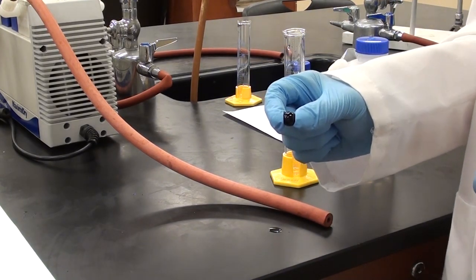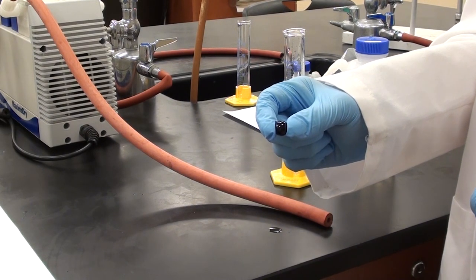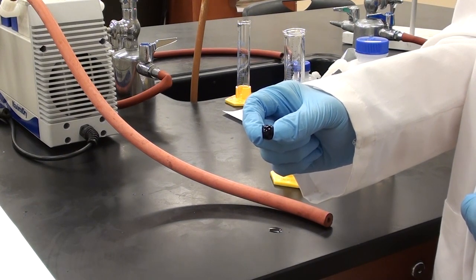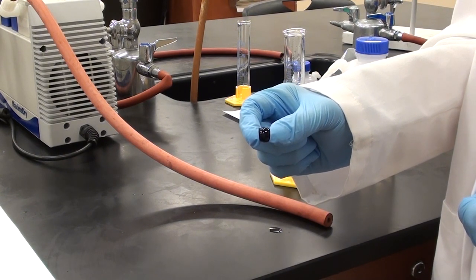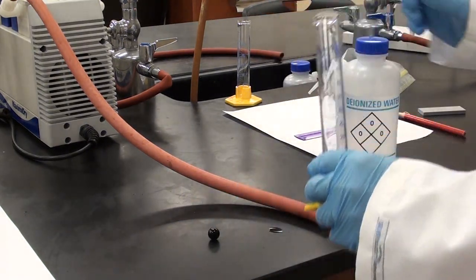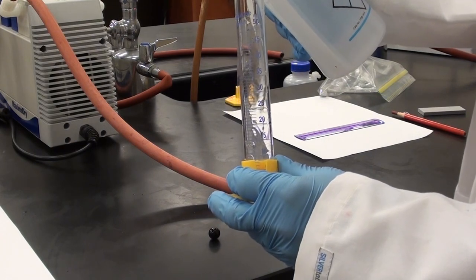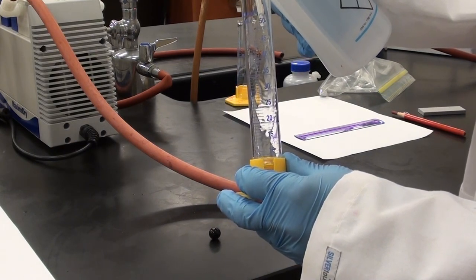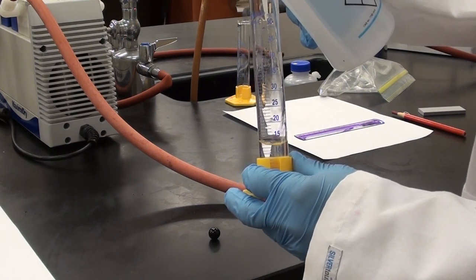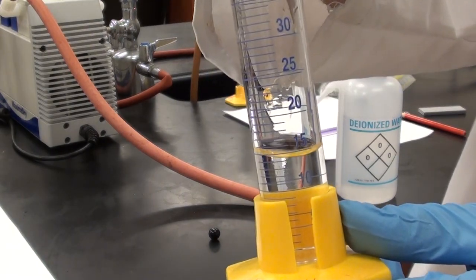So we're going to measure the volume of this glass sphere here, which is effectively just a marble. We could do so geometrically if we use the diameter, but we don't have any calipers. So we're going to measure the volume by using the displacement of water. So what we're going to do is we're going to add about 15 mils to this graduated cylinder. It doesn't have to be exactly 15, but it does have to be certainly more than the volume of the sphere that we're measuring.